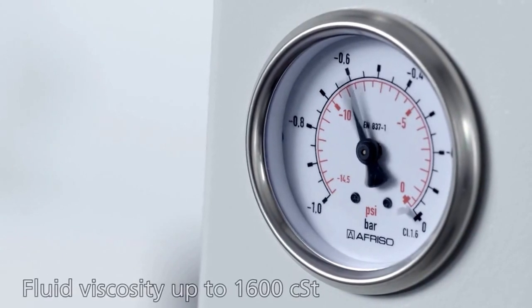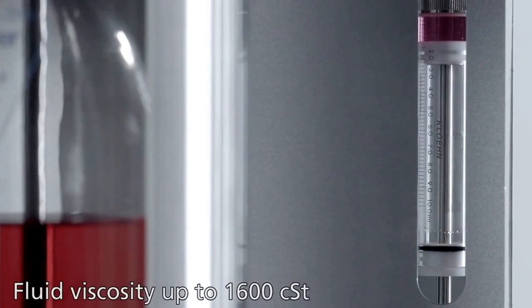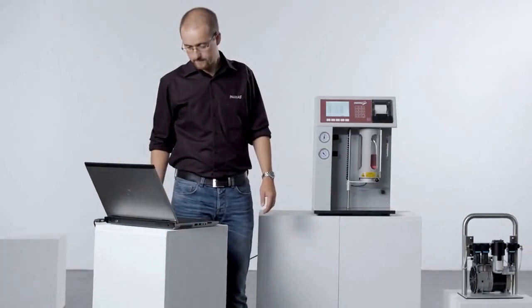Pressurized sampling allows oil with up to 1,600 centistokes to be measured with the PAMAS SBSS.